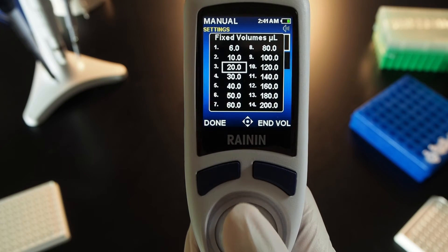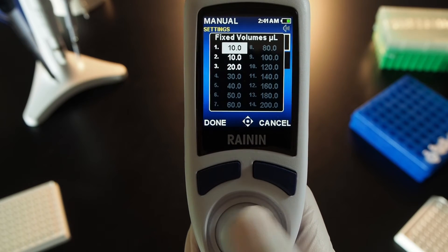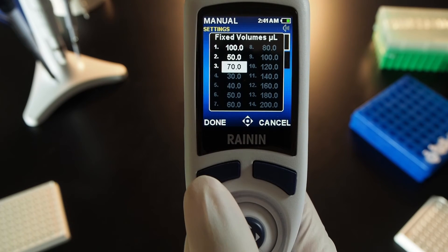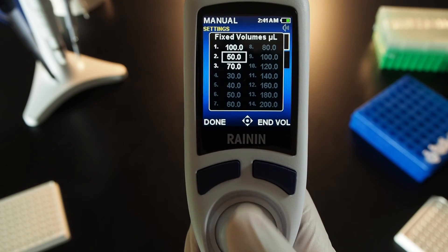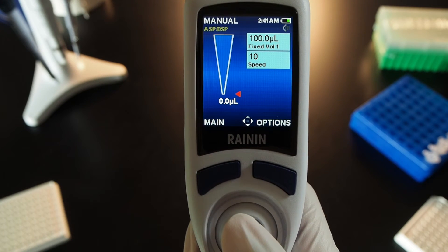Move the joystick to the last fixed volume you want to set, then press the right side button for end volume. Move the joystick to a volume and press the joystick in, then adjust left, right, up, or down to set the value. Press in to set that volume and move to another. When each volume is set, press done again to exit the fixed volumes list. You can adjust cycle speeds or press done to exit settings and run the first volume.